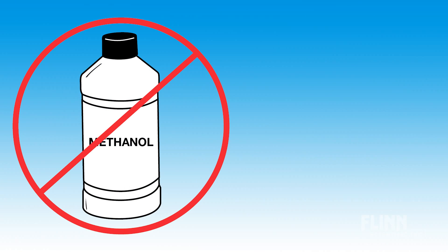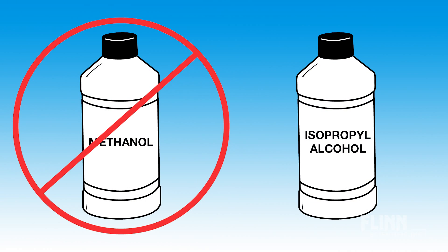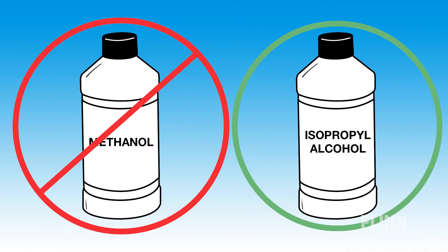Never use methanol for this demonstration. Methanol is very volatile and has the potential for the most violent combustion of any alcohol.